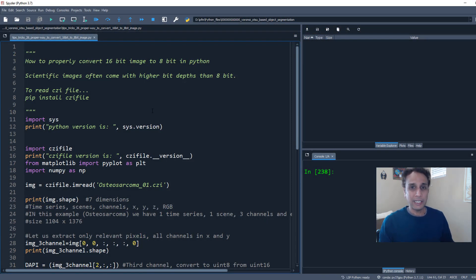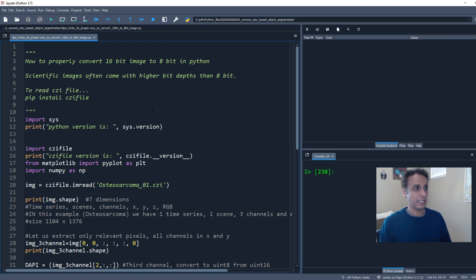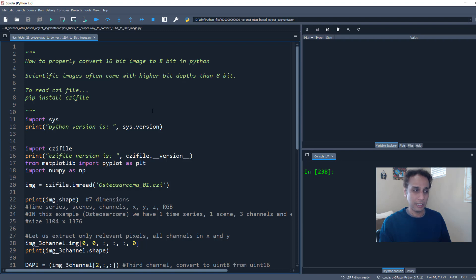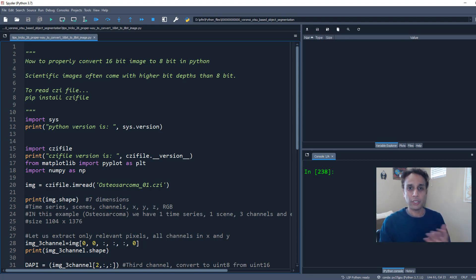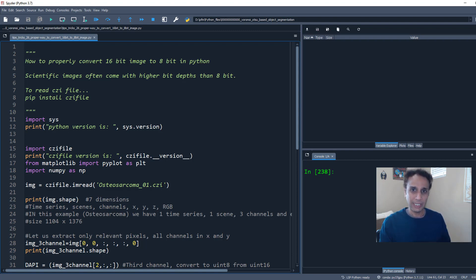So in my case, my 16-bit image is coming from a microscope, a Zeiss microscope to be precise. And Zeiss microscope, I store images as CZI format. Of course, you can save them as TIFF and others.